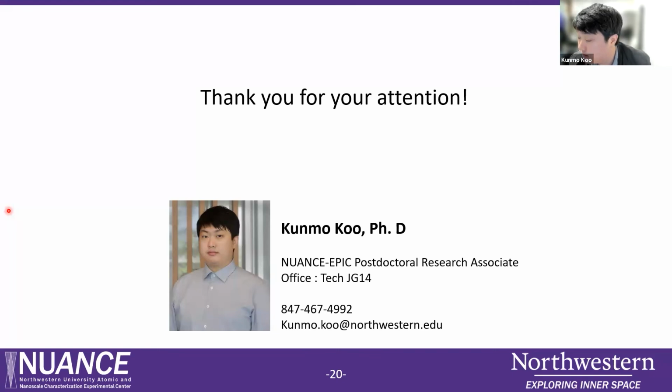Yeah, I believe there was a question in the chat as well. Yes, resolution of the GLC compared to conventional HRTEM method and elemental mapping with this technique.